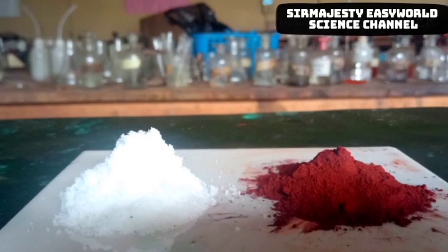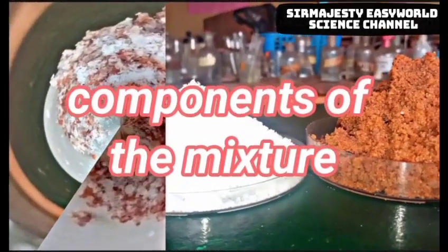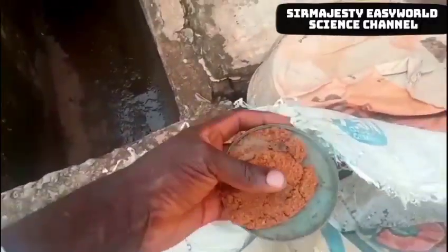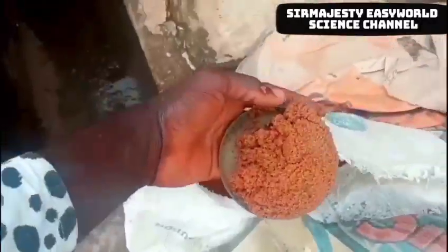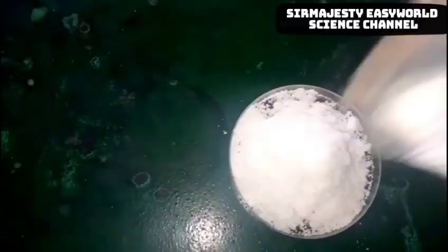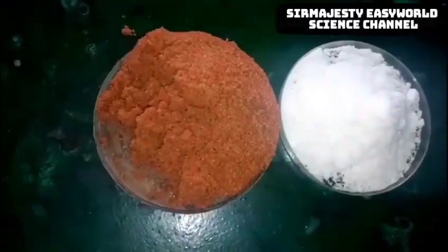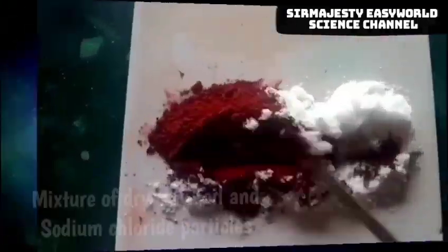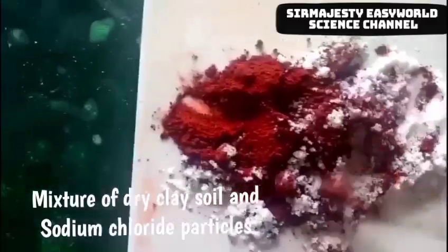Let's see how we can, in amazing ways, separate a mixture of sodium chloride and sand particles. We have the mixtures here. First we have the iodized salt — the common salt you use for cooking. Then we have the sandy soil; I also collected the clay soil. This method is applied for separating two solid particles of similar size that cannot be separated by sieving, where one is soluble in a given solvent and the other is not.